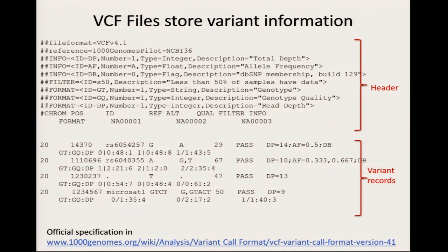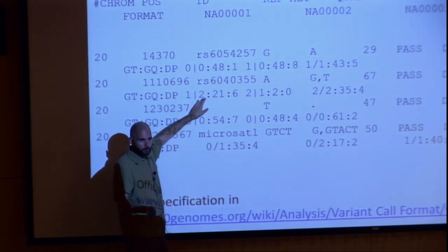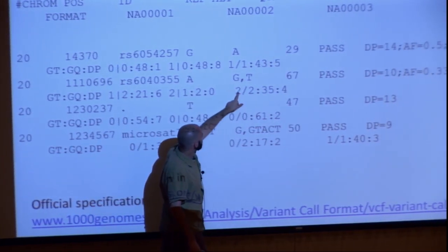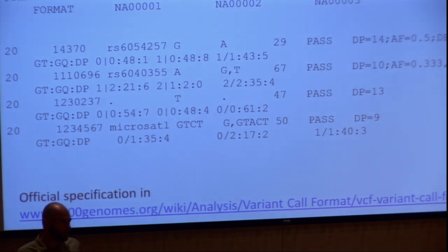So you can have multi-allelic variants. So this variant is at this position, the next line down, this position. And the reference allele is an A, but it's saying some people in the population were G and some people were T, right? And so this sample, the NA1 sample, is a 1, 2, meaning that one of the alleles was G and the other allele was T, because it's zero-based indexing, right? So GT, this middle sample was also GT, and the final sample was TT, homozygous for the T. Does that make sense, how it can happen?